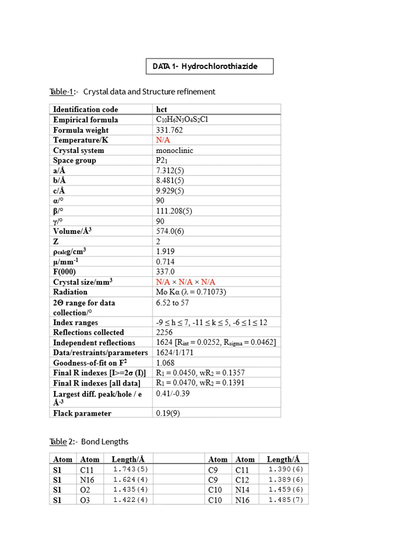We solved the three datasets given to us by using two software. One is OLEX2 software and the other one is VESTA software. The OLEX2 software gives us the electron densities with the help of which we refine the structure and determine the crystal structure, and with the help of VESTA we do the crystal packing arrangement and calculate the number of atoms per unit cell, and then the PXRD data with the help of VESTA software, and we prepared this report.